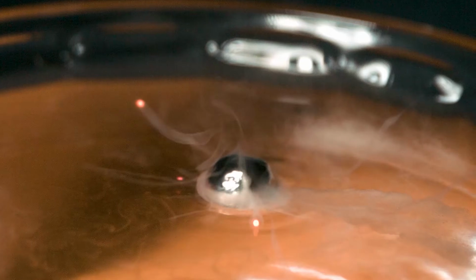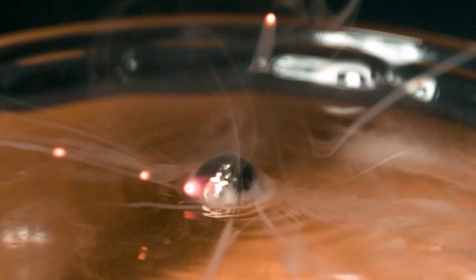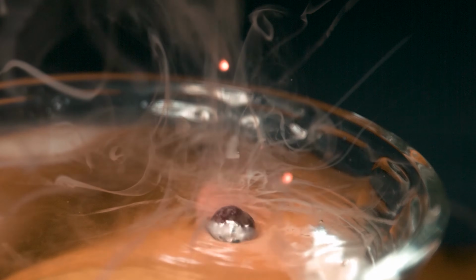You can see the surface of the potassium bubbling and roiling. Obviously it's totally molten now because it's a sphere. And then you can see the flames kind of like shooting off of it and kind of like geysers erupting and then going into more excited times when it's just shooting material off violently in all directions. And then other times it's a little bit more quiescent and getting ready for the big finale there.